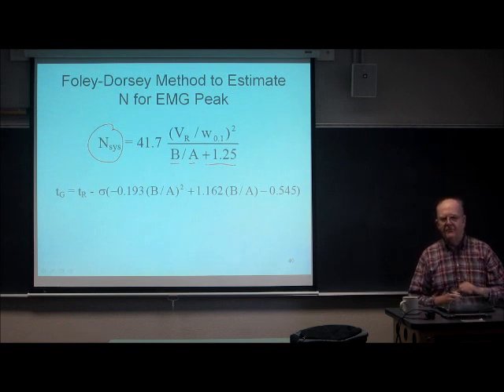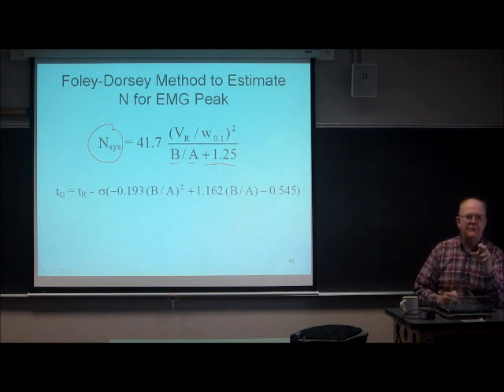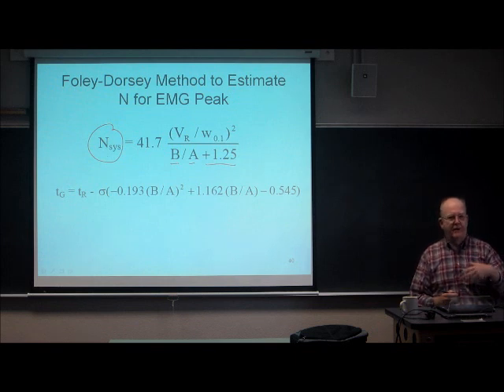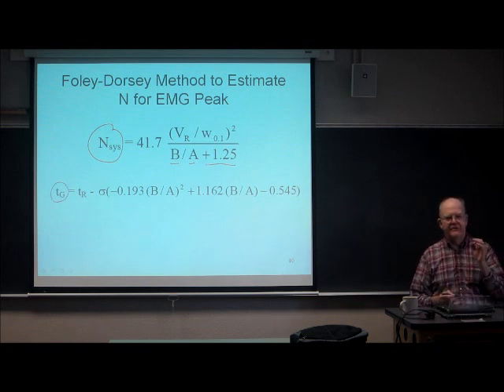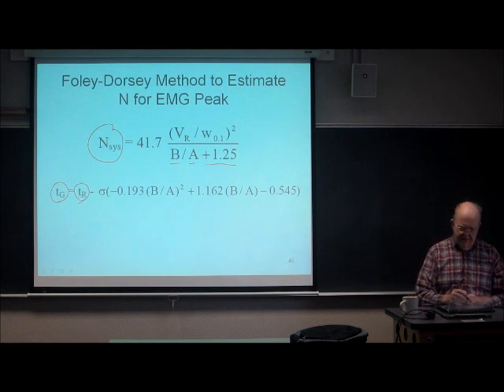If you were to take this tail peak and apply the Gaussian formula to it, you would get a number that is really different from this number, depending upon the degree of peak asymmetry. If the peak was really asymmetric, this number could be quite different than what you'd get by saying the peak is Gaussian. The other thing is, if you want to get the retention time of the real Gaussian peak, that you get from measuring the time of the peak apex, and then you apply this correction factor.